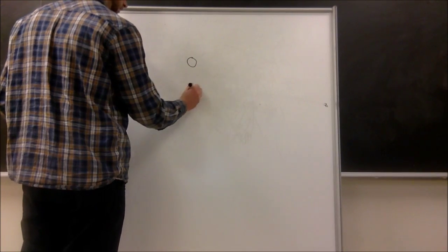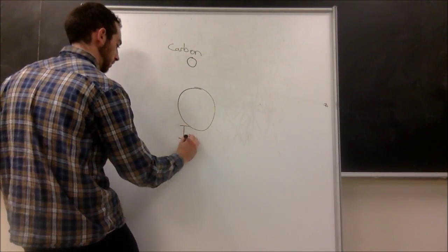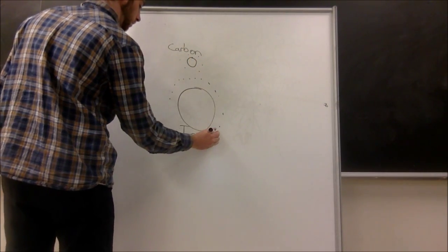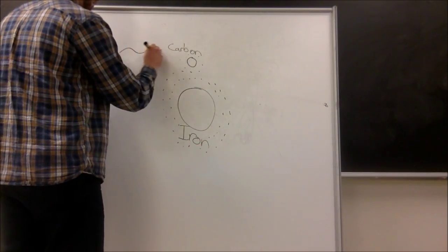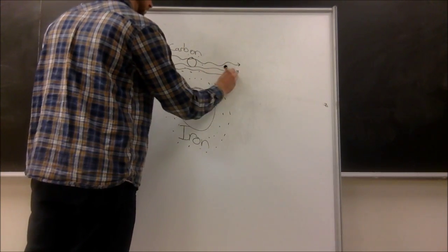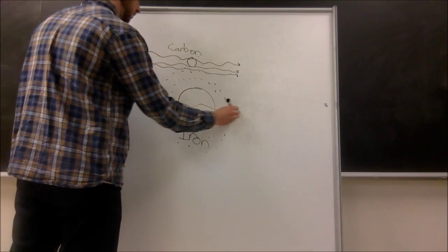So how do the X-rays interact with your sample? The X-rays are essentially being absorbed by heavy elements in your sample. Heavier elements have more electrons than elements like carbon, oxygen, or hydrogen. With more electrons, there's a higher probability that your X-ray will hit an electron, thereby absorbing the X-ray and raising the electron's energy level. As a result, some X-rays pass through your sample and some don't.